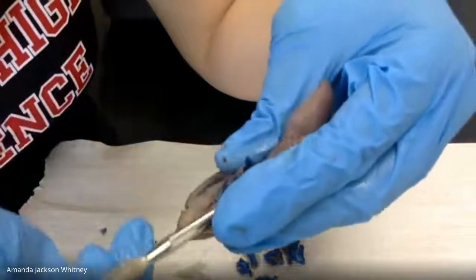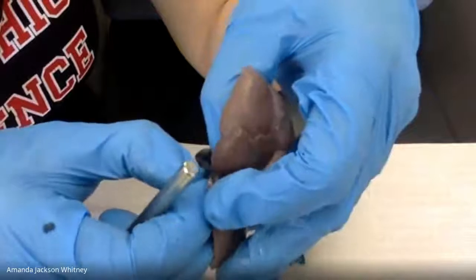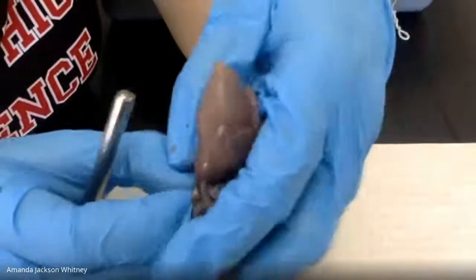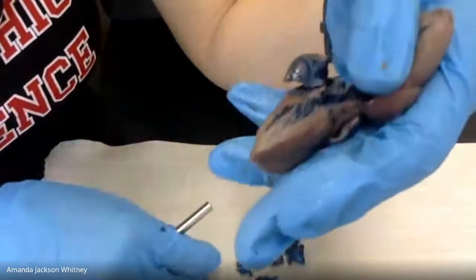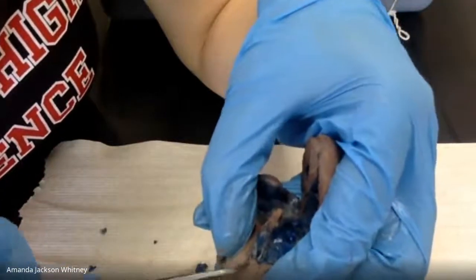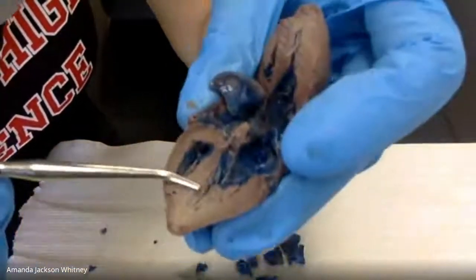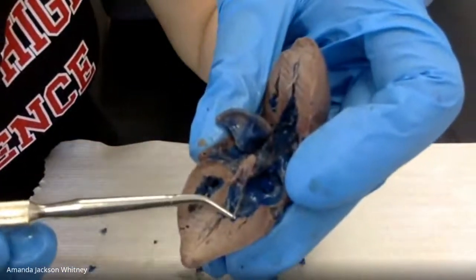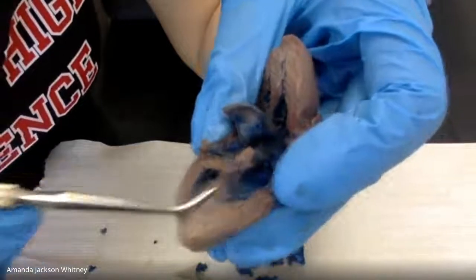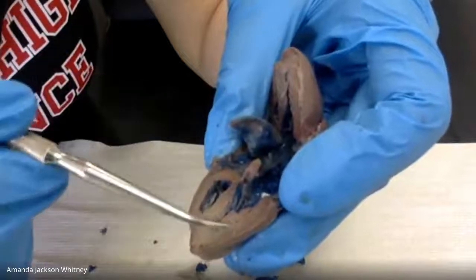Going once. Going twice. I know it's hard when you guys don't have to actually ever memorize anything. You're just looking back at formatives. Those are the papillary muscles. So the papillary muscles are what connect to the chordae tendineae. So that's what this is right here, connected to the chordae tendineae. And when these contract, it can pull the valve down to allow blood to flow down.